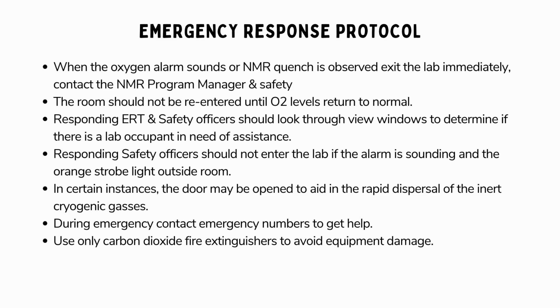Safety officers are cautioned against entering the lab while the alarm is sounding and the orange strobe light is activated outside the room. In specific scenarios, opening the door may be necessary to facilitate rapid dissipation of inert cryogenic gases. During an emergency, immediately call the designated emergency numbers for assistance. If a fire extinguisher is needed, use only those designated for carbon dioxide to prevent damage to equipment.